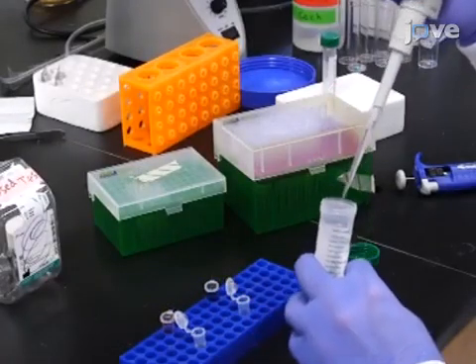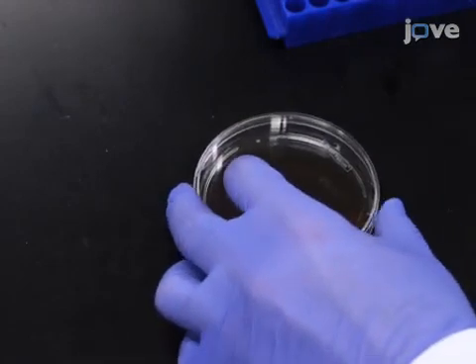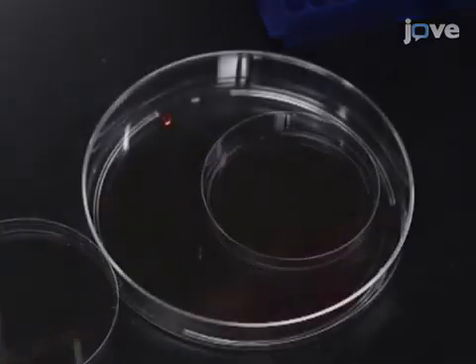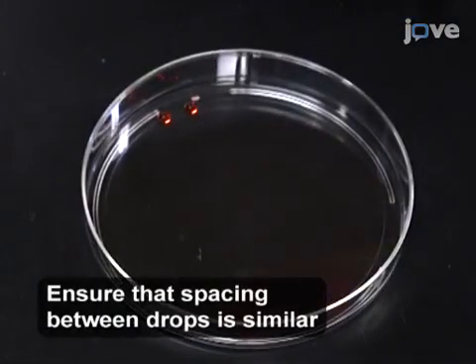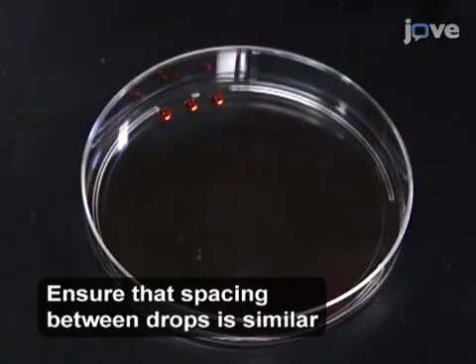Next, prepare the experimental tastant of 5 millimolar sucrose. Then, create the assay chambers by obtaining a 100 mm by 15 mm plastic petri dish and placing three 10 microliter drops of controlled tastant as close to the edge of the plate as possible at the 12 o'clock position.